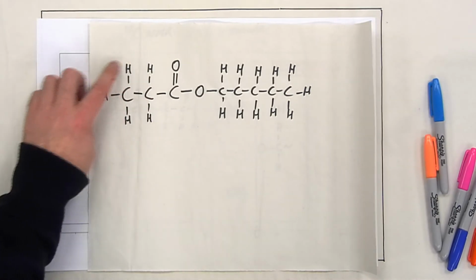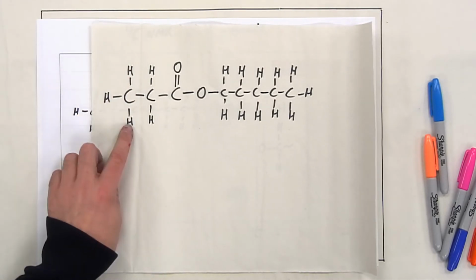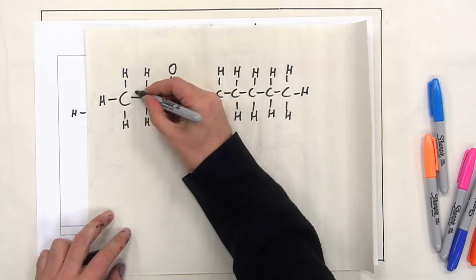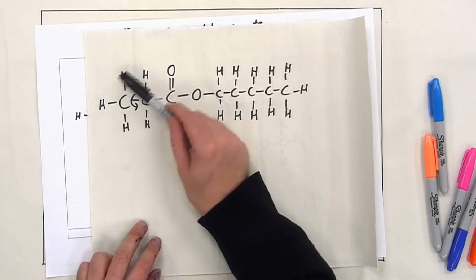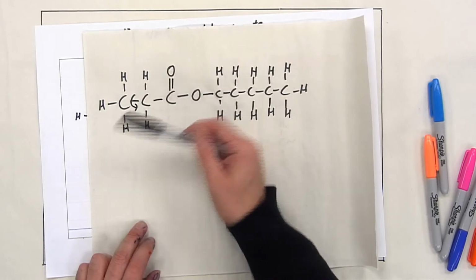So let's just start with the CH3 at the end. The first thing I suppose to point out at this stage is to make sure you're all aware that all those 3 hydrogens, the ones that attach to the same carbon, will all be in the same chemical environment. The reason for this is we essentially get free rotation about the carbon-carbon bonds, which means these hydrogens are changing place very, very rapidly. So we get one chemical environment for that, one chemical environment for that, etc.